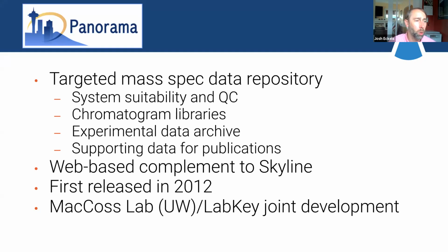So looking at the poll results, thanks everyone for logging. It looks like most folks have worked with Skyline. About 79% of attendees, 17% said they had worked with Panorama, and 11% on AutoQC, leaving us with 27% that are getting their first exposure to this. So thanks, that helps, and it's great.